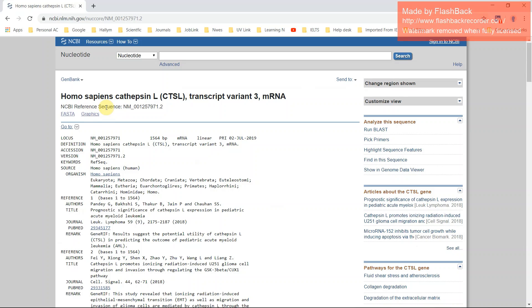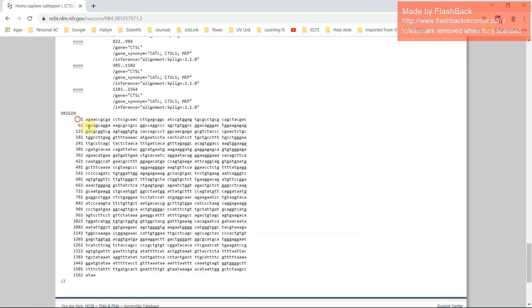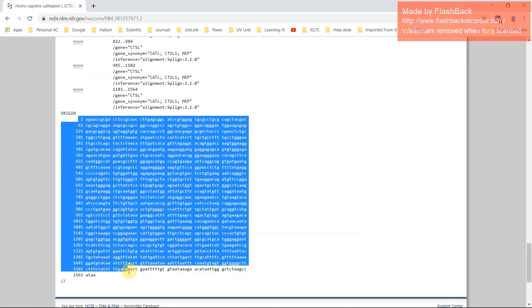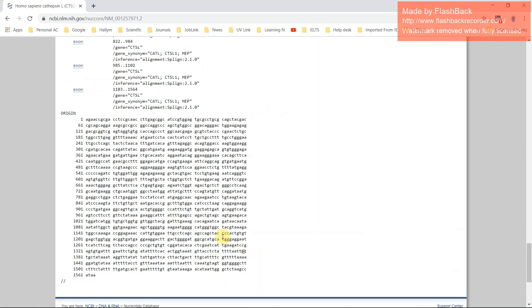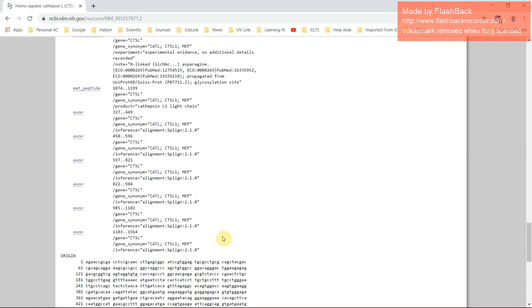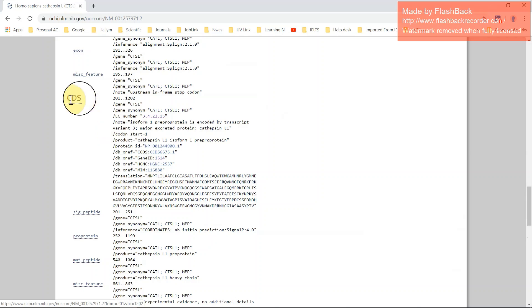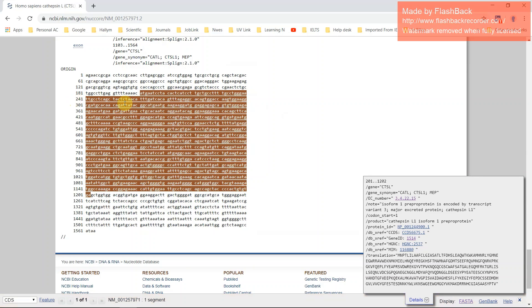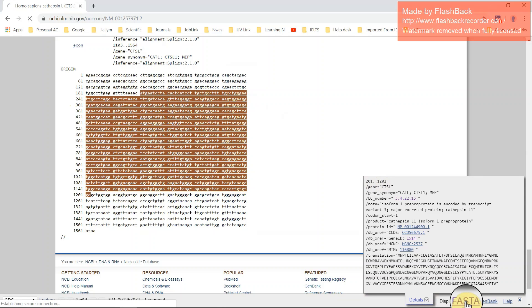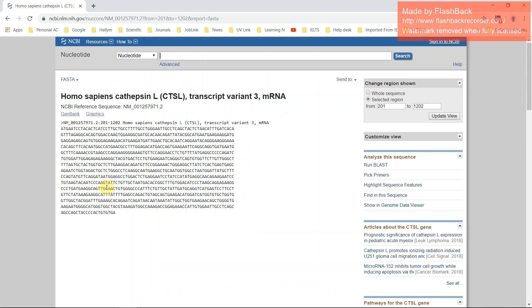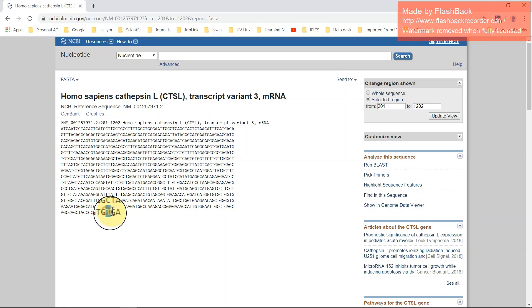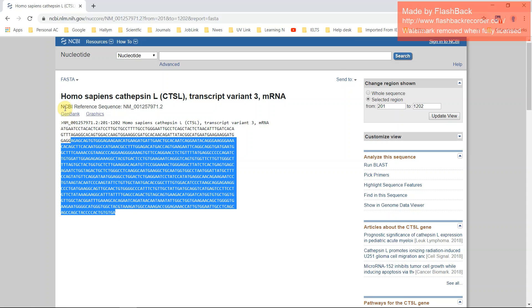This is the homo sapiens cathepsin L transcript variant 3 mRNA. This is your total gene. If you want to clone your coding region, then click here CDS and it will select and it indicates from 200 onto 2200. Just click the FASTA format. This is your gene sequence. It starts with ATG and it has also the stop codon.